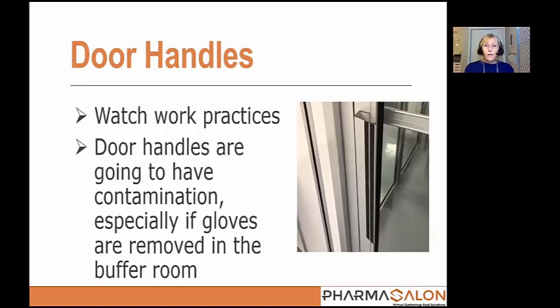Then we have the door handles. If your organization has moved to a hands-free system, you don't really have to worry about this at all. I wouldn't sample the doors because nobody should be touching them. However, if you still have that door handle, that manual door that you have to pull open, watch your work practices.